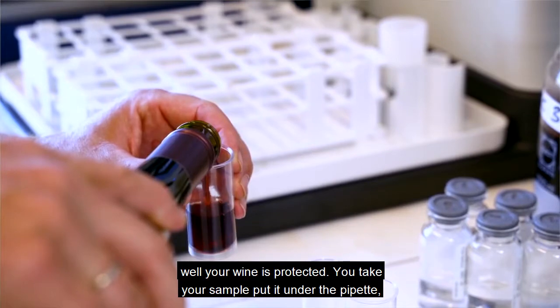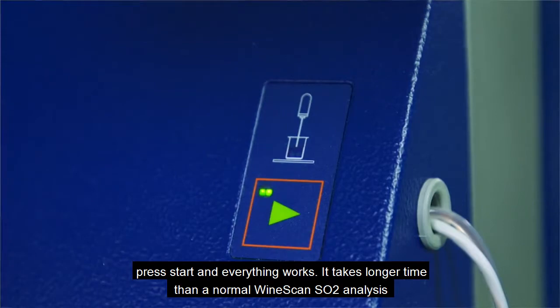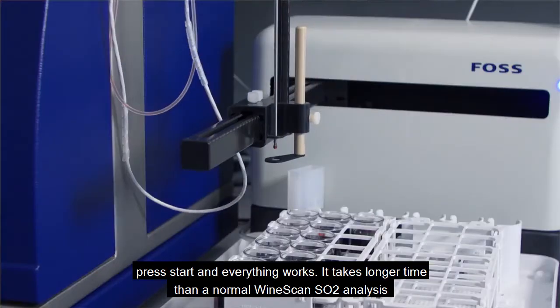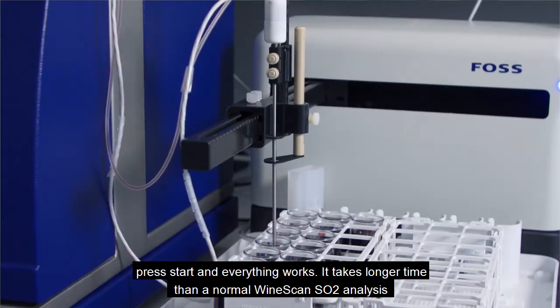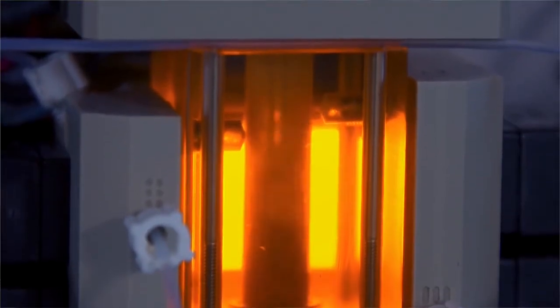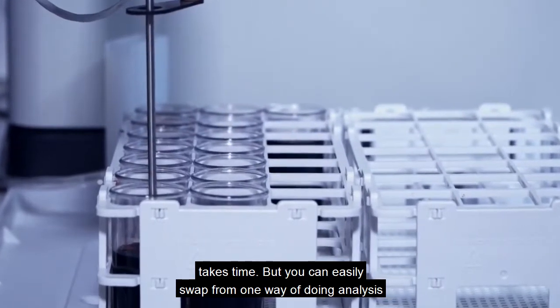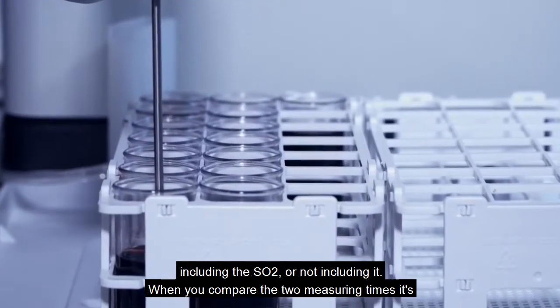You take your sample, put it on the pipette, press start, and everything works. It takes longer time than a normal Winescan analysis because we still have to separate, and the separation process is taking time. But you can easily swap from one way of doing analysis, including the SO2 or not including it.